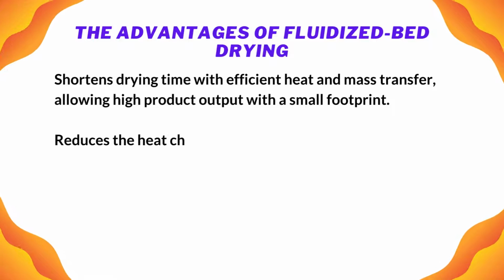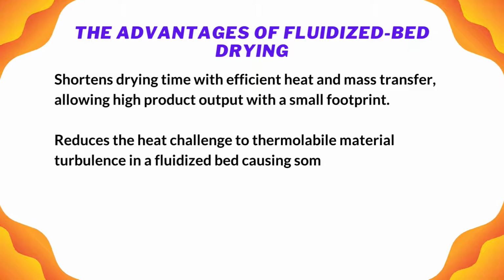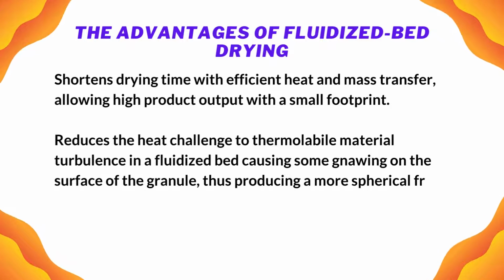The advantages of fluidized bed drying: shortens drying time with efficient heat and mass transfer, allowing high product output with a small footprint. Reduces the heat challenge to thermolabile material. Turbulence in a fluidized bed causes some gnawing on the surface of the granule, thus producing a more spherical free-flowing product.